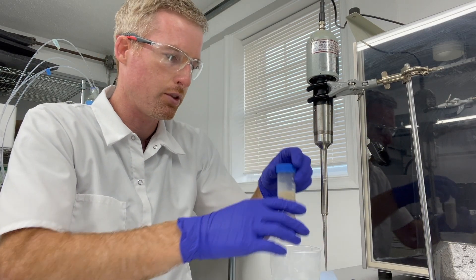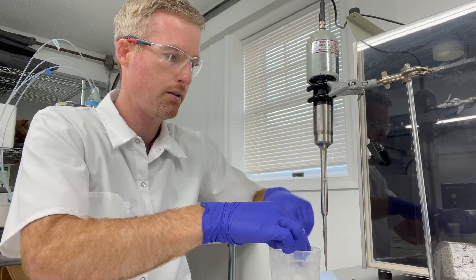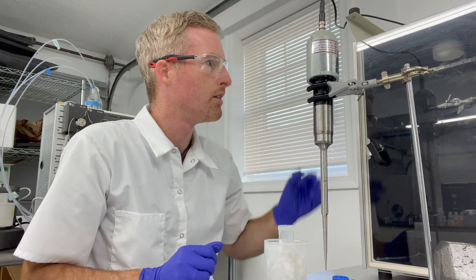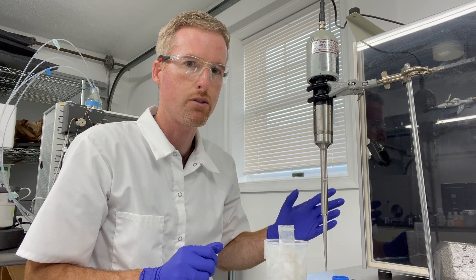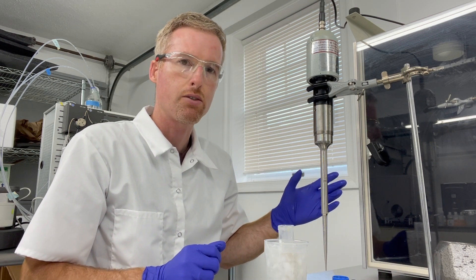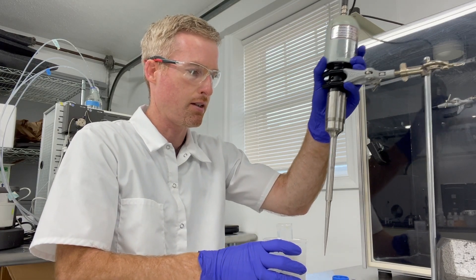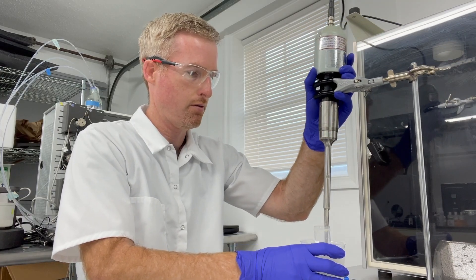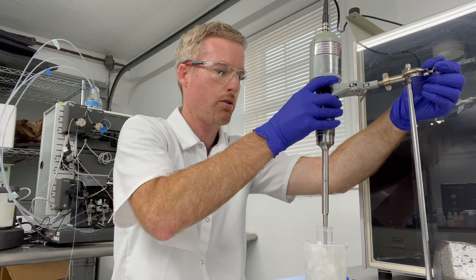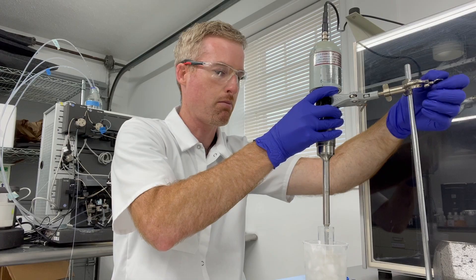So I put the 50 ml tube in the ice and take off the cap. I've got the sonicator out of the soundproof compartment it's usually in because I want to show you the tip. This is my Sonic 3000 sonicator with the micro tip attached. I lift it up, put it in, and lower the micro tip down until I feel the bottom of the tube, then lift it up about an inch.